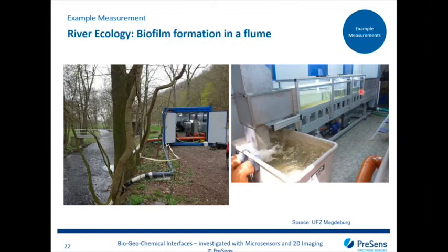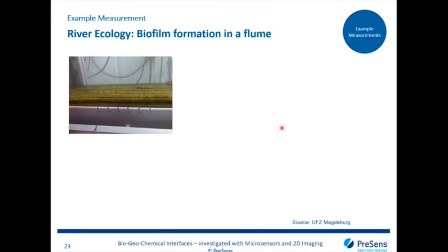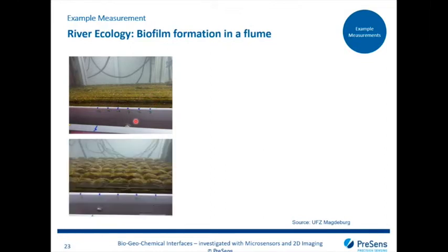So it can be kept constant, and this is why we can study the biofilm formation with actually most of the parameters well known and well defined during an experiment. The biofilm formation was monitored under different flow heterogeneities or topographies. To do that, actually the bed of this flume was embedded with glass beads. In this case, we've got very, very fine glass beads. You can't see them anymore because they're actually already completely overgrown by biofilm, by sediments, by detritus, by algae. So it's a whole microbial and probably also eukaryotic winter wonderland in there. Everything is present, which already covered those glass beads, those very, very small glass beads. Then we had different scenarios of glass beads to create certain surface roughness.